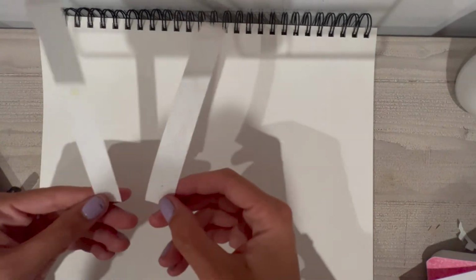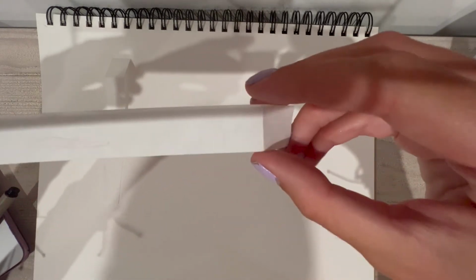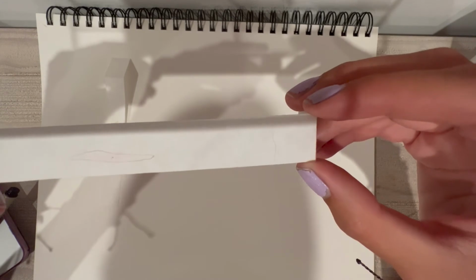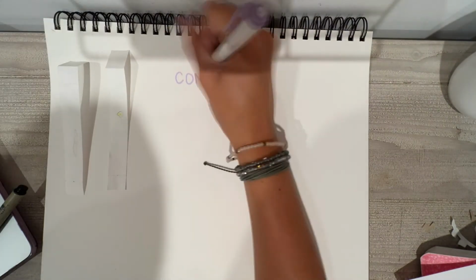Once the strips have been removed from the flask, you want to lightly outline the solvent front, which is how far the solvent has traveled up the strip, lightly with pencil, and outline the colorful dye dot. These are the results of the tartrazine sample and the red M&M dye. Our results are extremely faint, so I'll explain some potential areas for error later on.